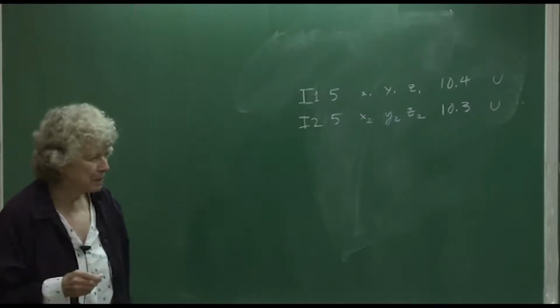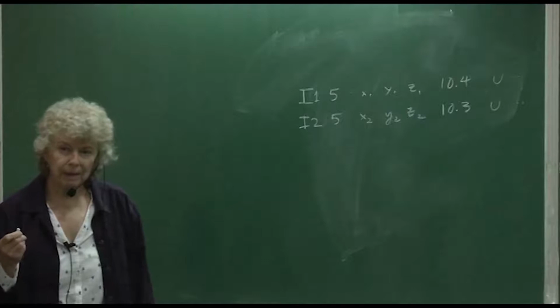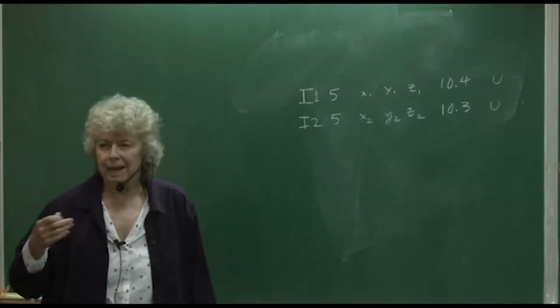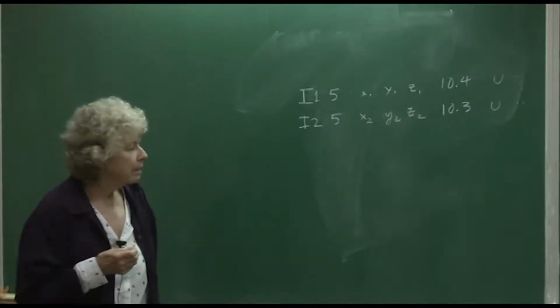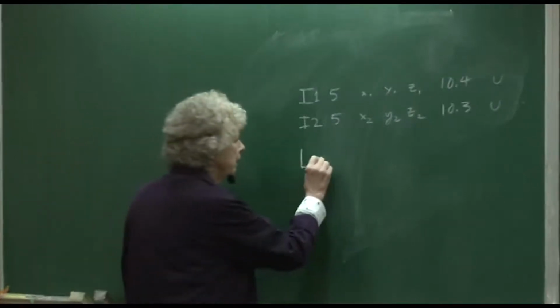So my approach to this is to look up how many general positions there are in that space group. Not the special positions, but the general positions. Like, for example, the space group C2/c has 8 general positions. P2₁/c has 4 general positions. So this is another trick too, is to look in the LST file.